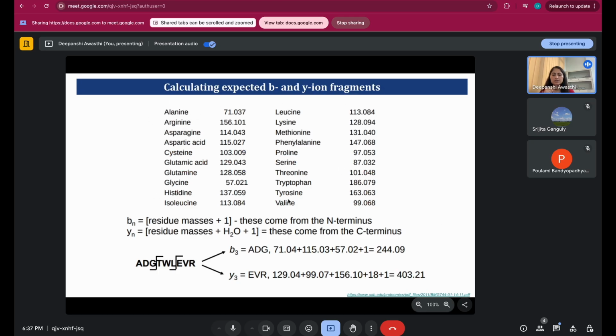In this I have given the information about the mass to charge ratios, so that you can compare. Different amino acids have different mass to charge ratios, so by looking at these ratios, you can infer by comparing different peptides. When the peptides are converted into fragments, they will be consecutive fragments. When I say consecutive, it means that one fragment has, for example, 5 residues, another has 6 residues.